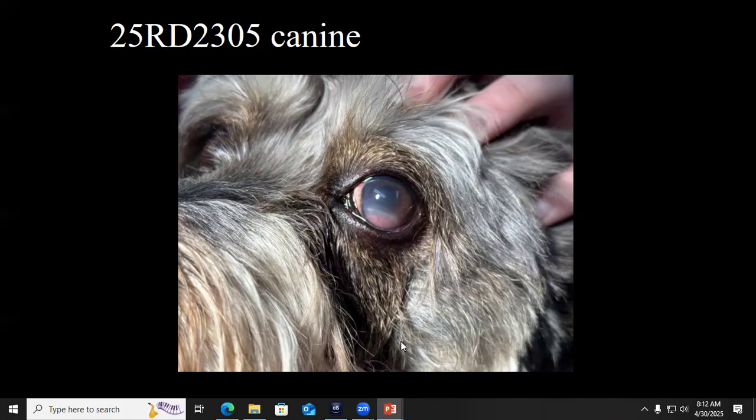So here's our clinical image, and what we described grossly, we can see part of that here. We said that there was a tan mass affecting the ventromedial iris, which likely is this right here. Concurrently, we also described a tan mass over the dorsolateral equatorial sclera, which we can't really see in this image, and they didn't describe clinically, so probably it's getting obscured by the adnexa up here.